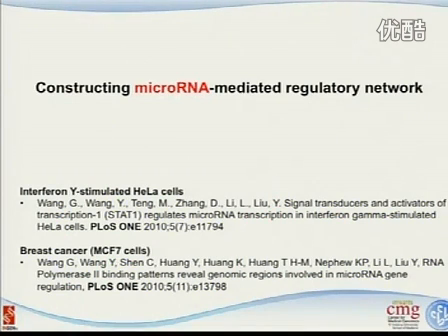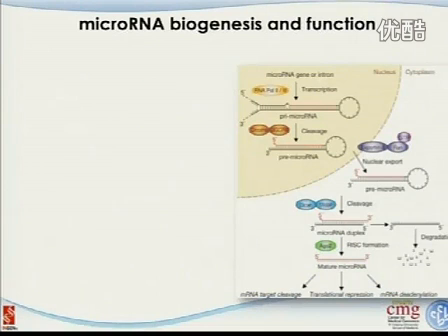And we want to study the microRNA-mediated regulatory network based on the RNA polymerase II derived ChIP-seq signals. And these are the two papers if you're interested, and you can go look at them. So very briefly, let me talk about microRNA regulation.